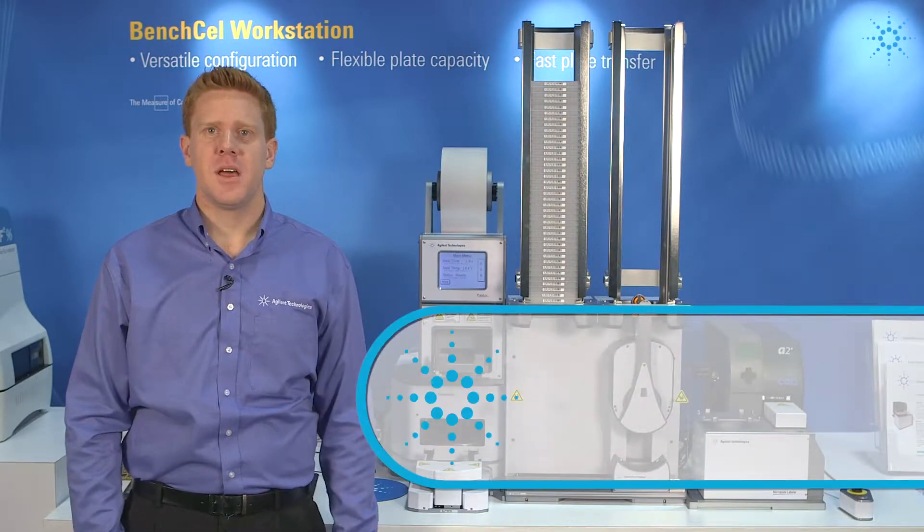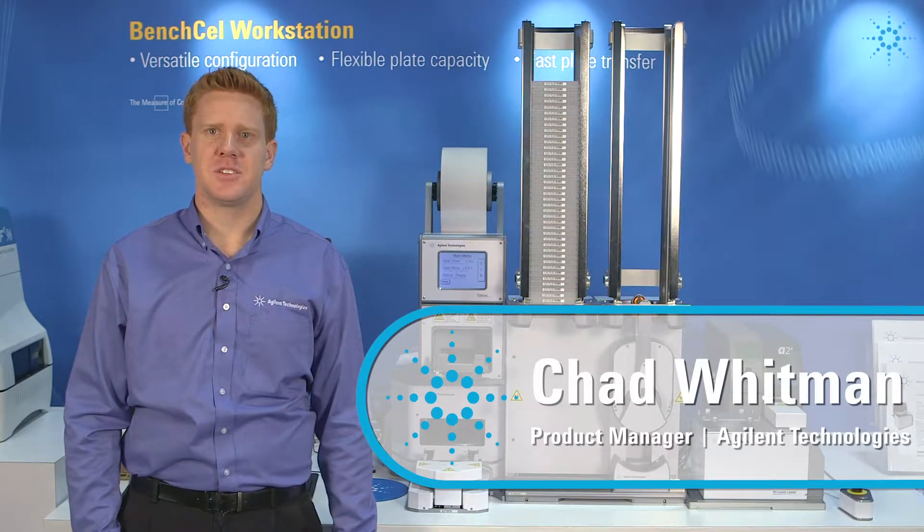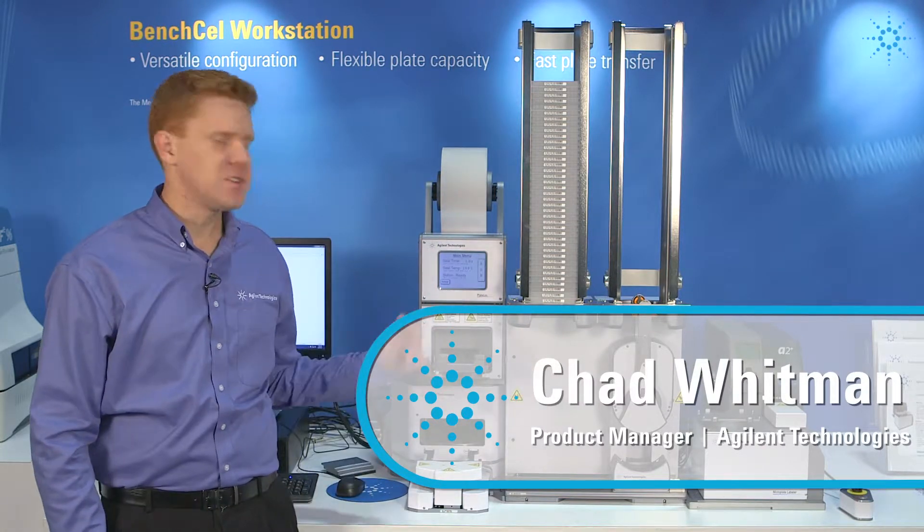Hello, my name is Chad Whitman and I'm a product manager with Agilent Technologies. Today I'll be walking you through the Bench Cell Workstation, which is our flexible platform for automating your microplate workflows.